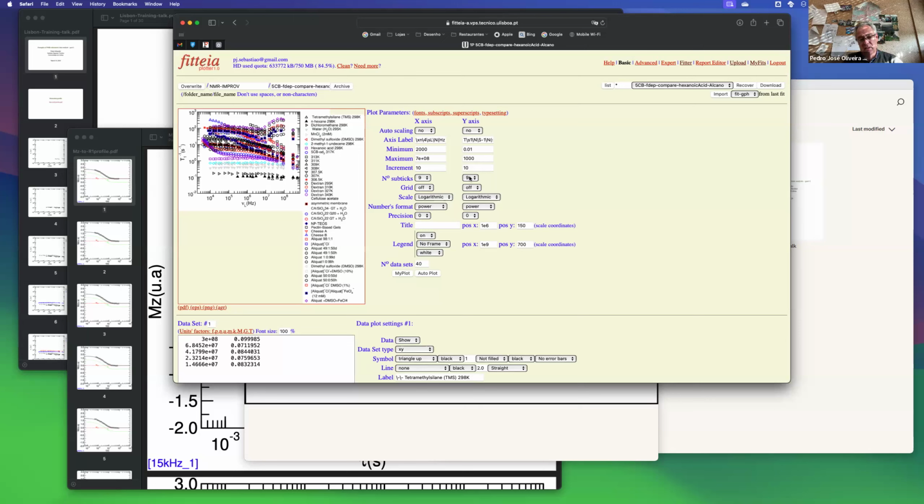and in some cases, when it comes to polymers and polydispersed systems, or natural compounds, better said, it might happen. Let's say crude oil is a nice example of this. You don't have just one exponential, not two, not three. You have a complete distribution of exponentials.